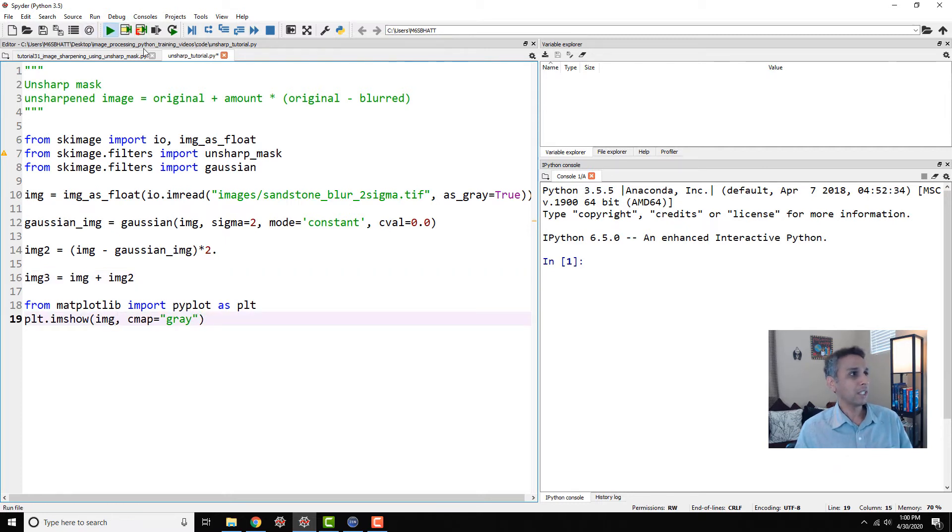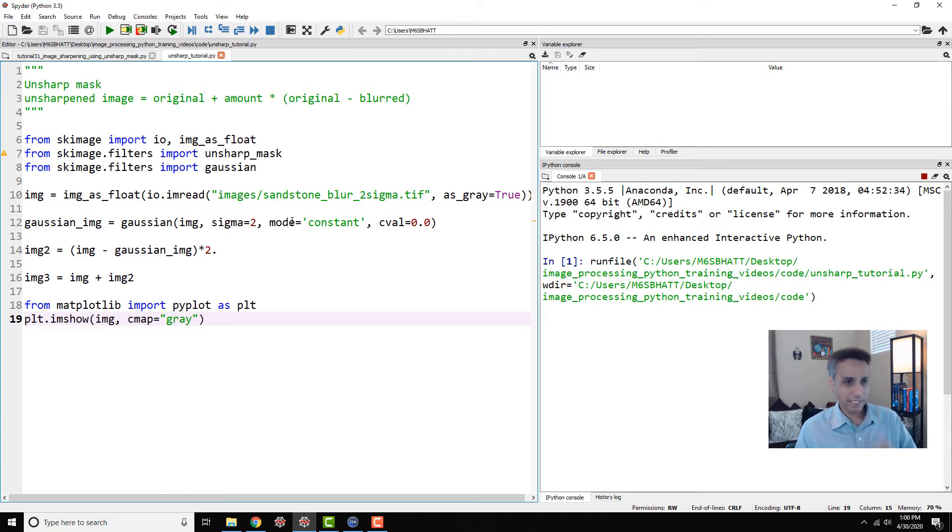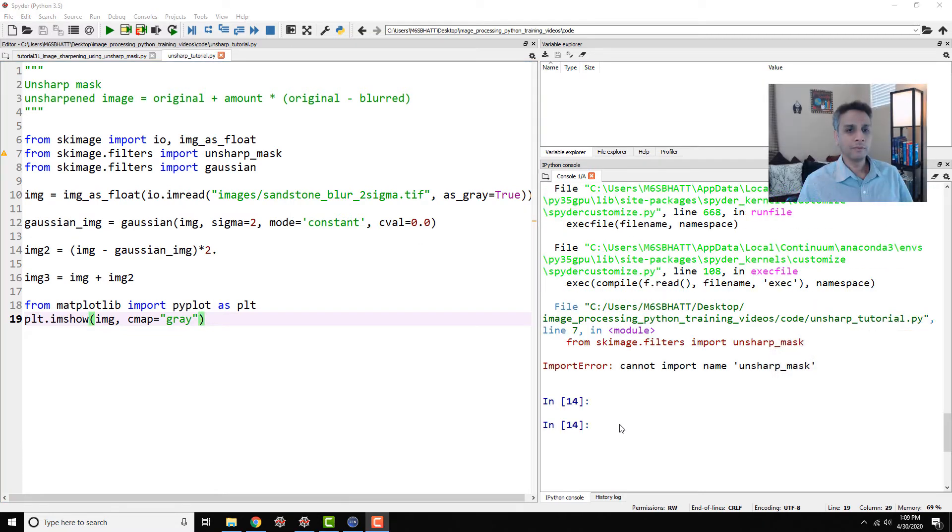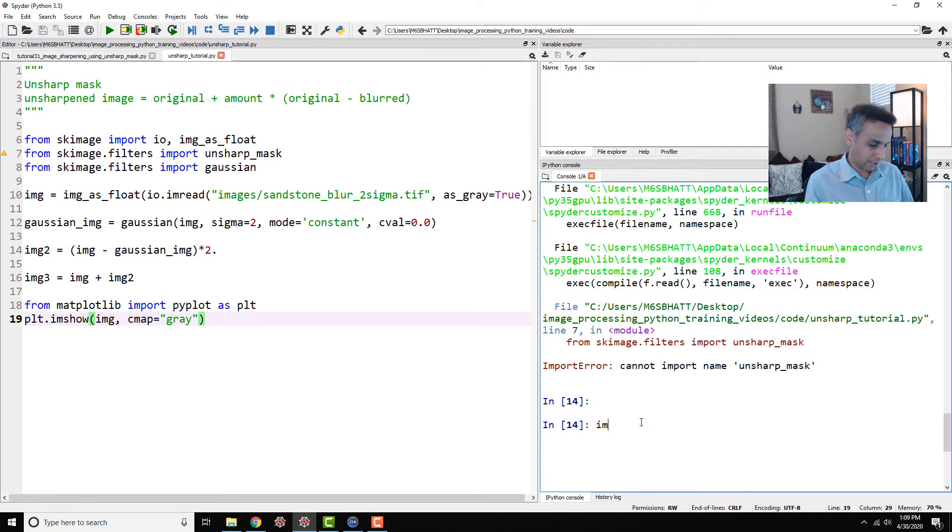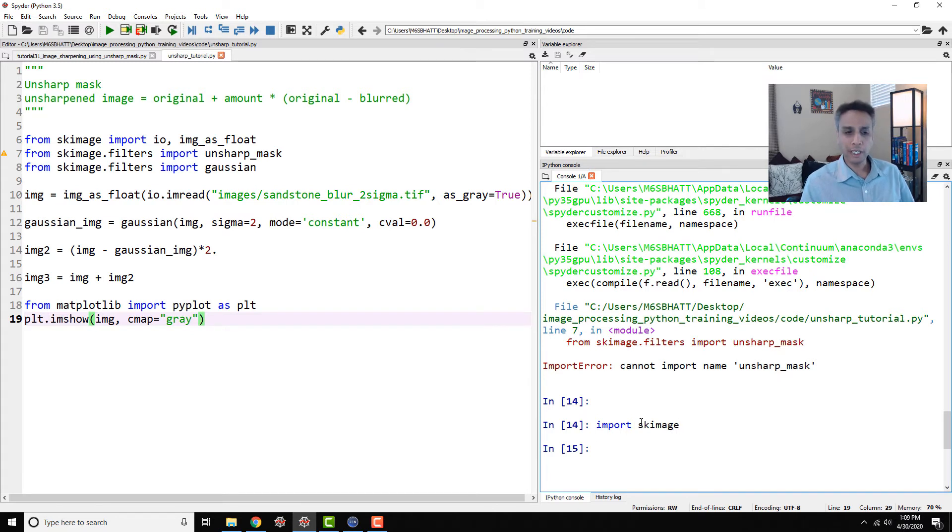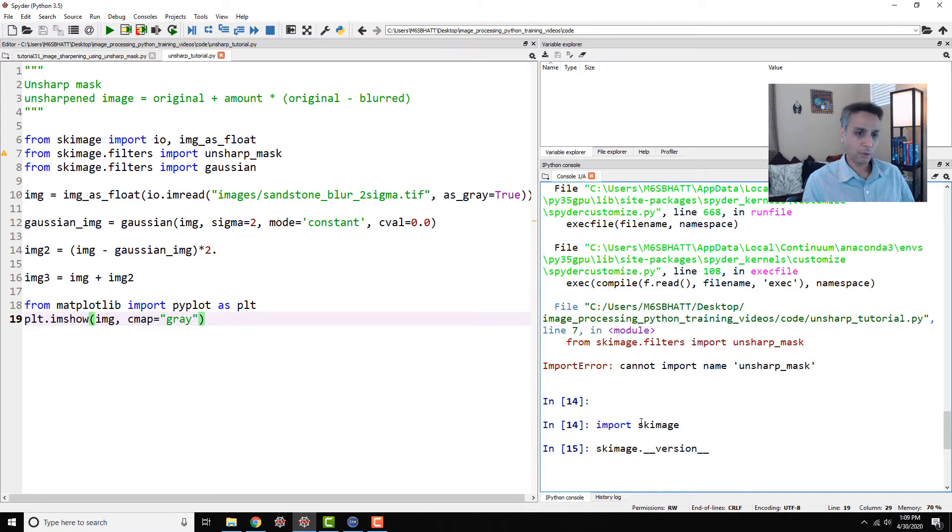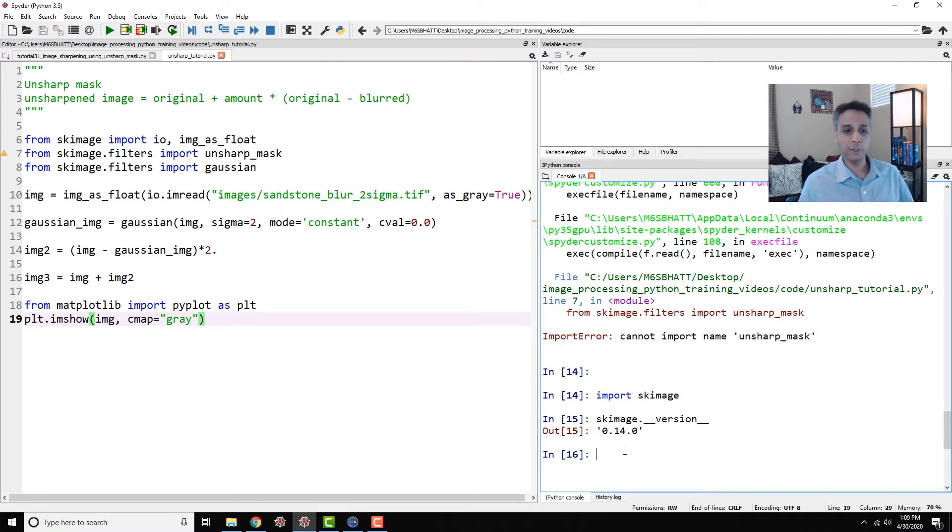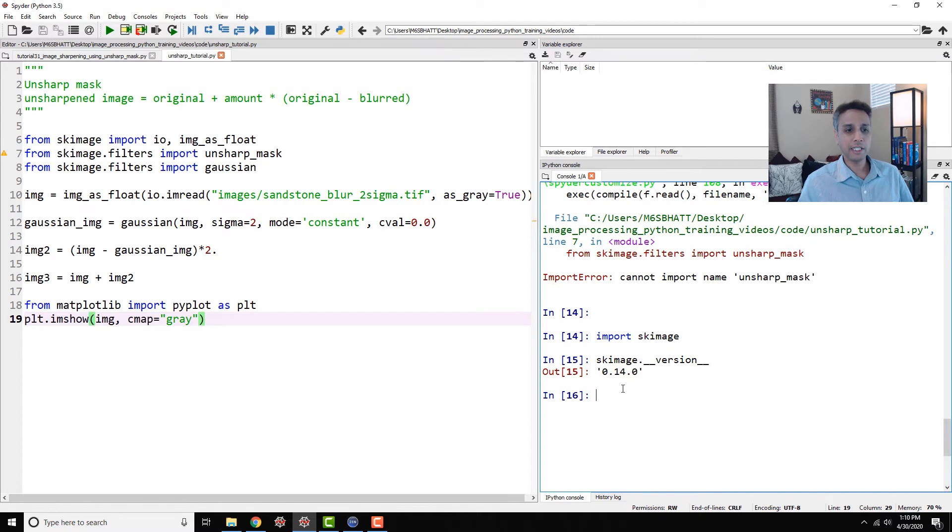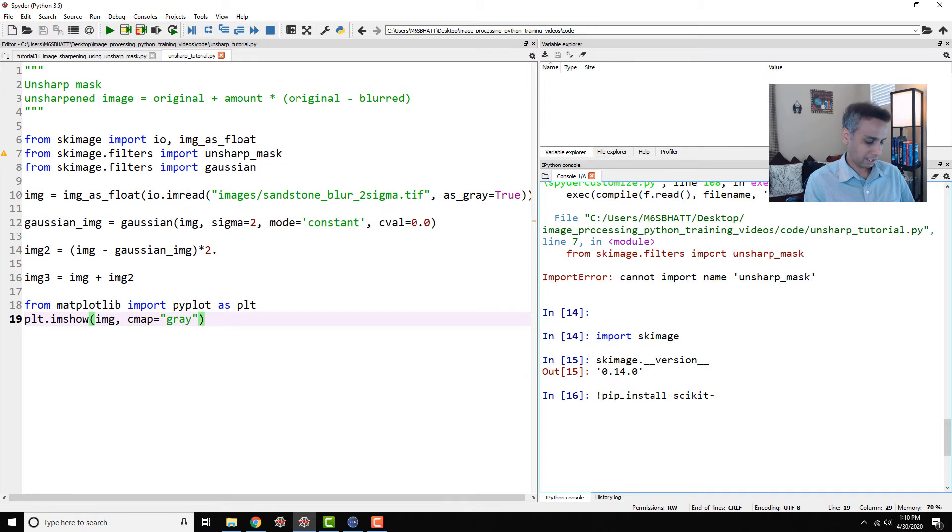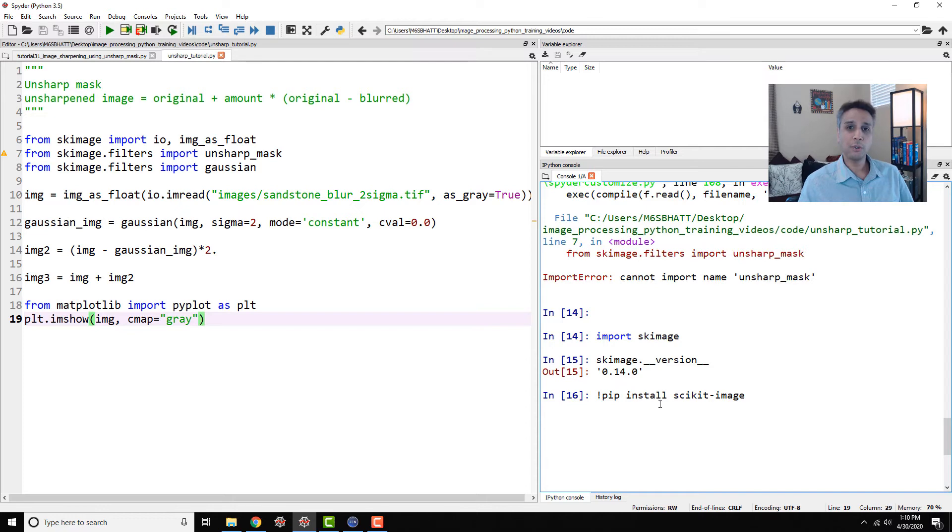Let's go ahead and first look at our original image. Looks like it cannot import unsharp mask, let's see why. First of all let's just import SK image, it works okay. Let's actually test our version and the way you do that is SK image dot underscore underscore version underscore underscore and you'll see it's 0.14.0. I believe the latest version is 0.17 as of April 2020. Let's go ahead and pip install this version again, it's pip install and remember this is scikit-image not SK image.